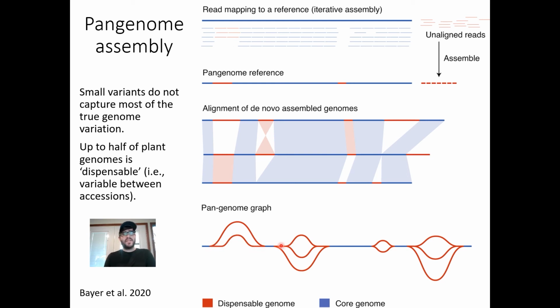Maybe in this case, it could be the chunk of DNA in one orientation, the chunk of DNA in a different orientation, and maybe this entirely new fragment. And this is a much better representation of what a genome actually looks like.